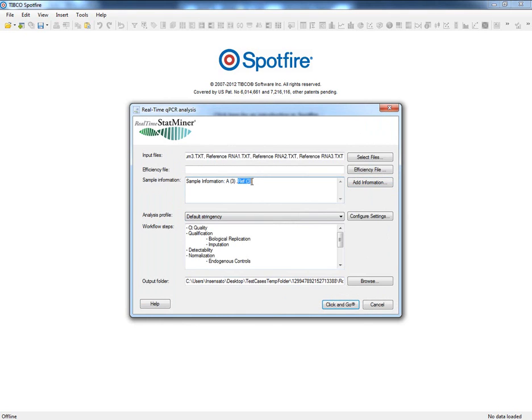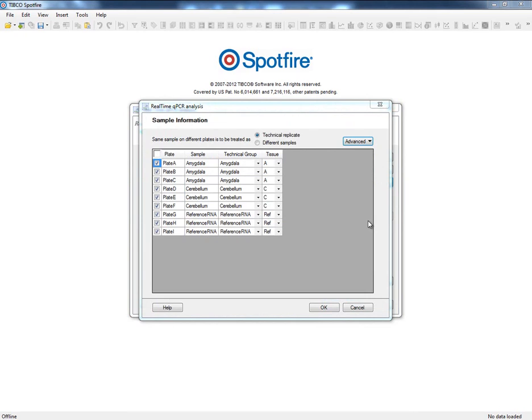To continue this tutorial, let's go back and propose a slightly more complex scenario where we can get into further details of what this option means and the technical group. Although it seems to be the same experiment, in this case the former biological replicates now seem to have exactly the same name.